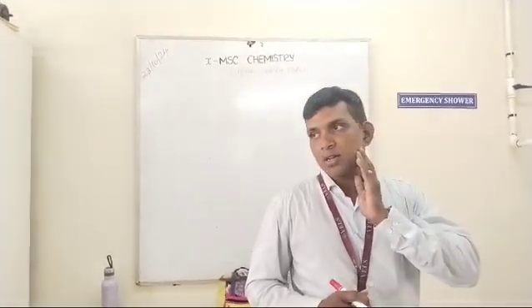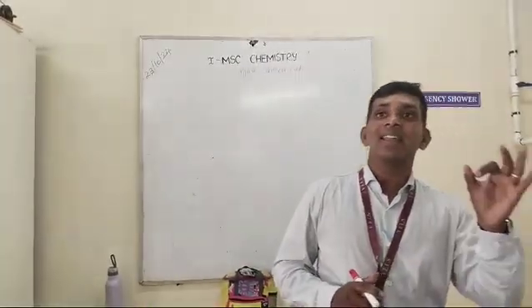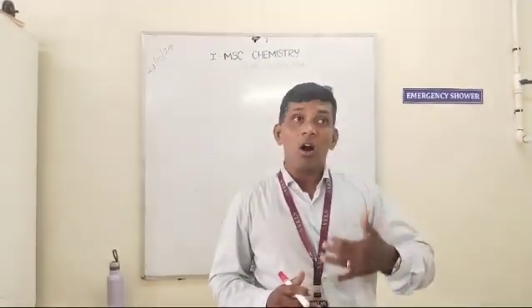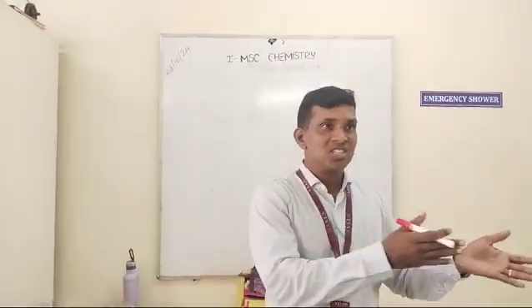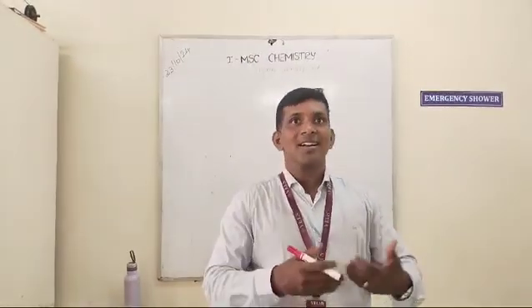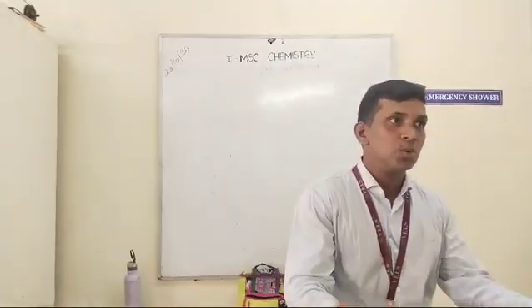Okay. So today I am going to discuss how we can separate mixtures, and the semi-micro analysis of the given functional group. Last class we saw mixtures such as carboxylic acid and phenol. These are a continuation of that procedure. Once again, let me repeat how we can separate the mixture when we are given an unknown sample.